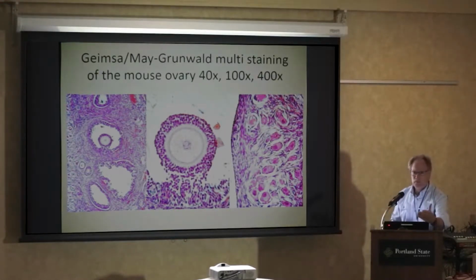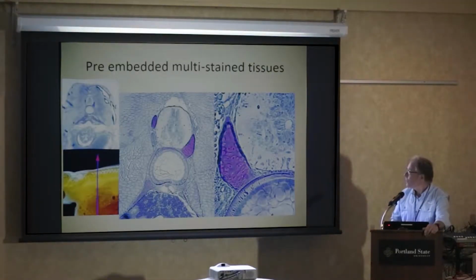Just have to basically get better at it and figure out what hue is indicating what particular tissue type. Okay.